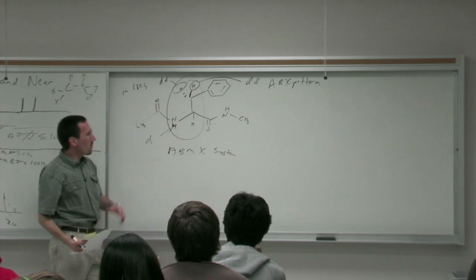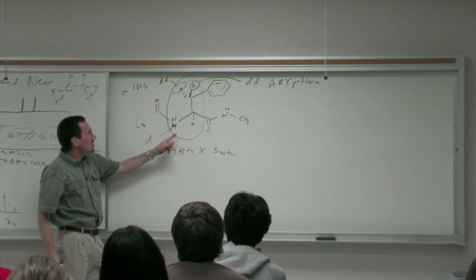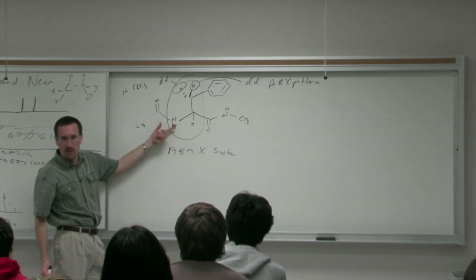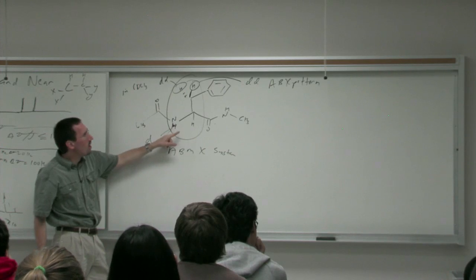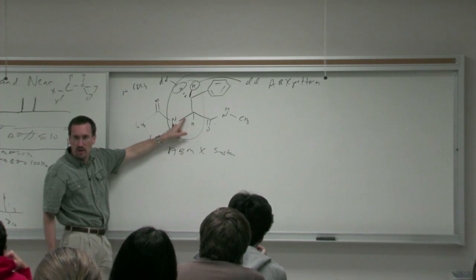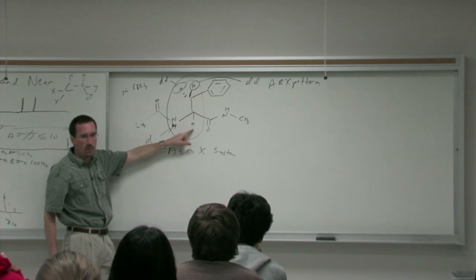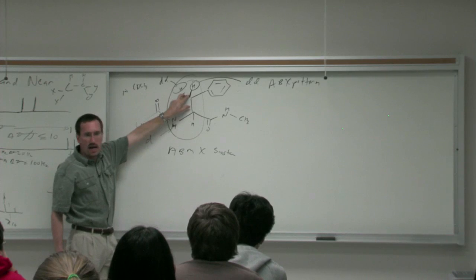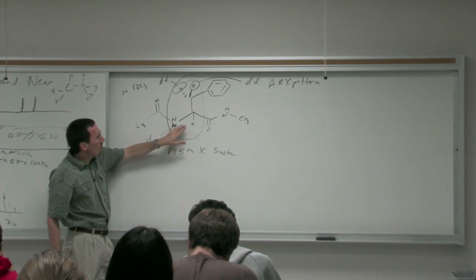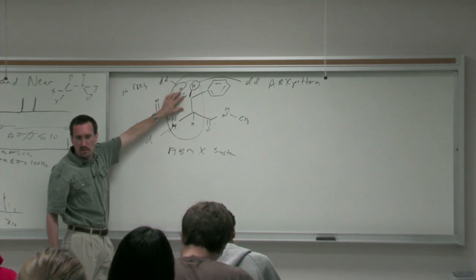M is something that's far apart from either A and B, and C and so forth, and X. So we have one proton that's going to be way downfield. Amide nitrogen protons are typically at about 7 parts per million. One proton that's going to be moderately downfield because it's next to an electron withdrawing group, alpha to a carbonyl and beta to a phenyl group. So this is going to be about 4.5 parts per million. And then these guys that are both going to be close to 3 parts per million. So we have the NH far apart from the alpha, and the alpha far apart from the beta.